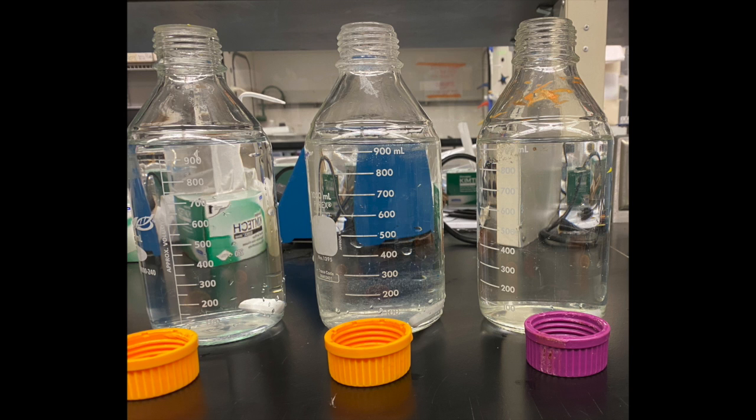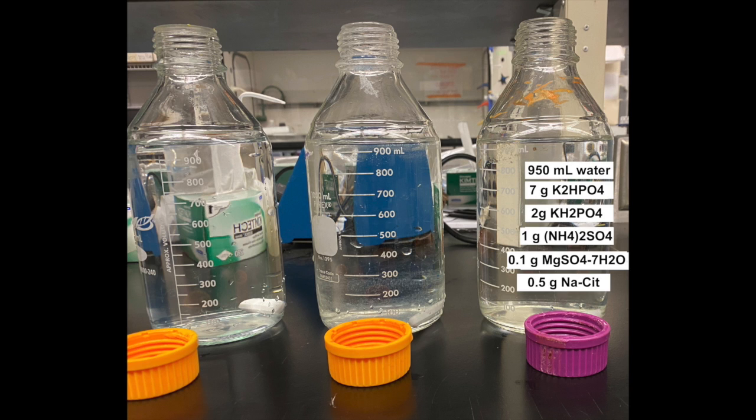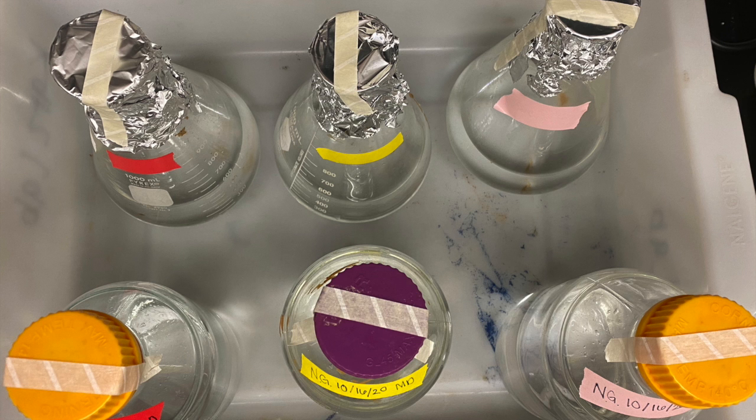Now to create the media that goes inside of the chemostat. We are going to use MD media. This media is a solution of DI water and high ionic salts. The MD solution will also need to be autoclaved in order to be sterilized.